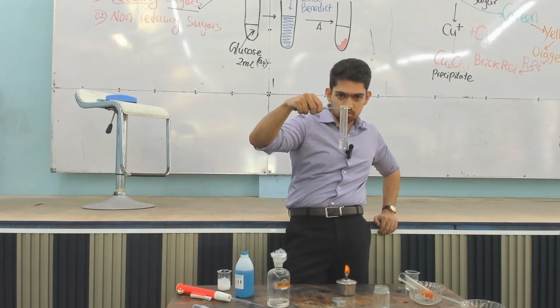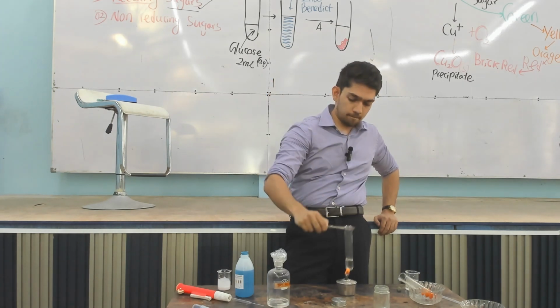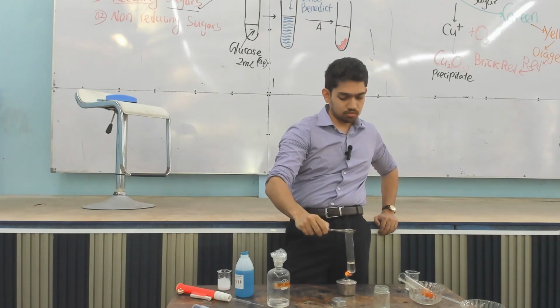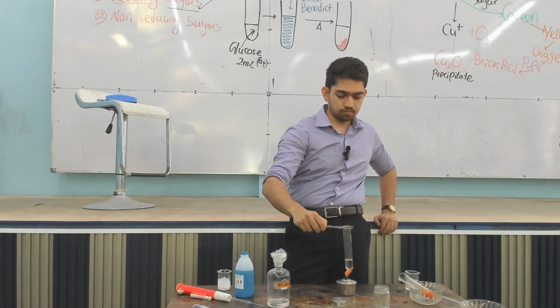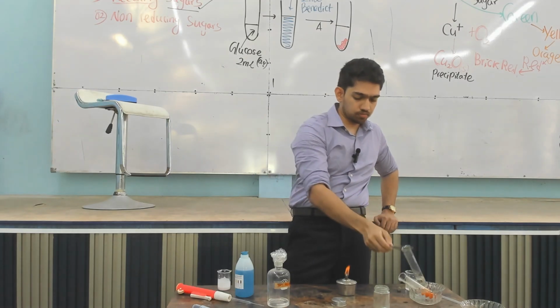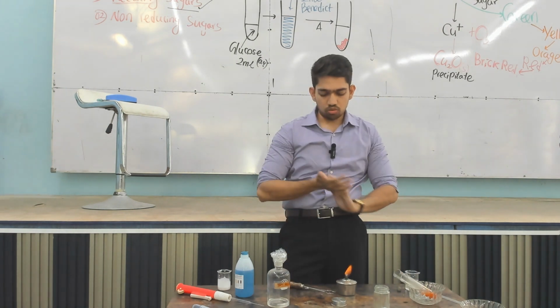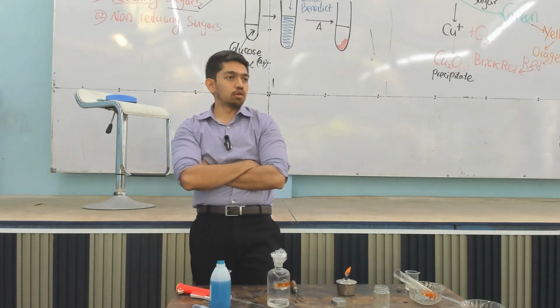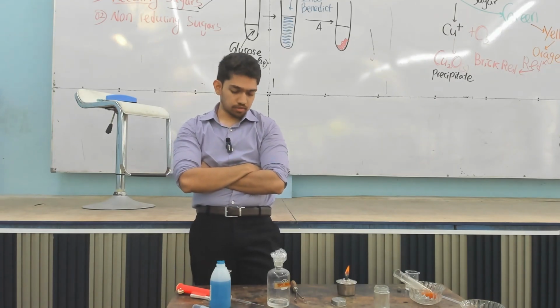I can see the smoke coming, so that should hold. So the sucrose should, theoretically, be digested, let's see, right? Because we are not exactly measuring the amount of acid, it may be enough or not enough, okay. I think that's enough, right? So we'll keep it to cool down a little bit. So what's the next step? You have to neutralize it with the sodium bicarbonate. Then you add Benedict's. When you do the Benedict test, you again heat it. Got it? Simple as that.